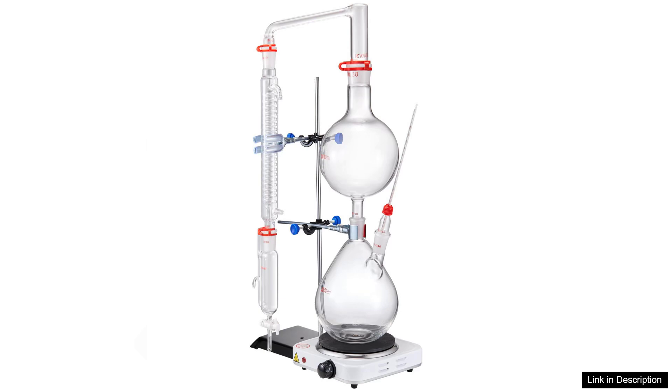Overall, the VEVA essential oil distillation kit is a fantastic investment for anyone interested in essential oil extraction. It offers excellent value for money and I highly recommend it to anyone looking to delve into the world of essential oils. Whether for personal use or small scale production, this kit is sure to impress.